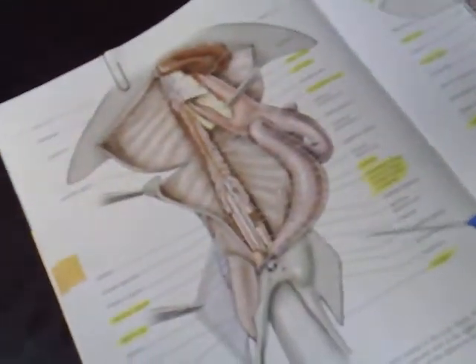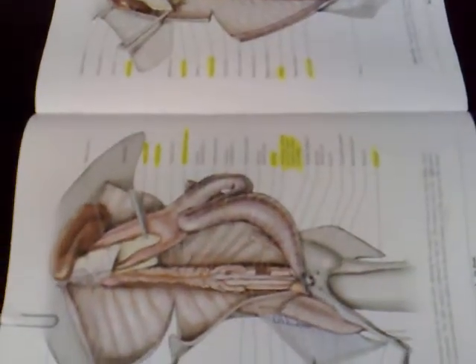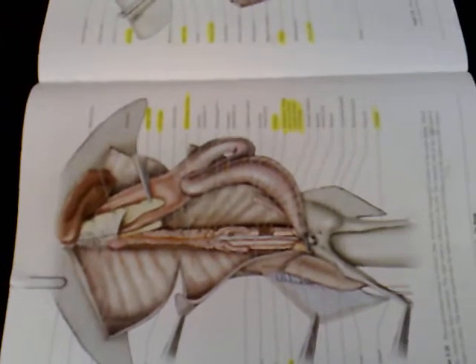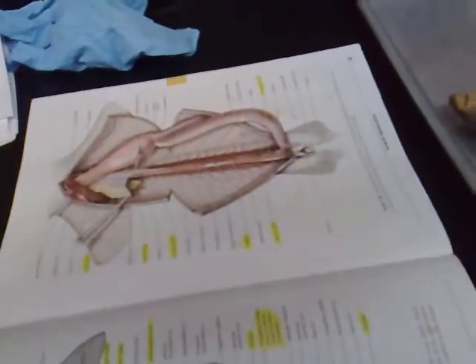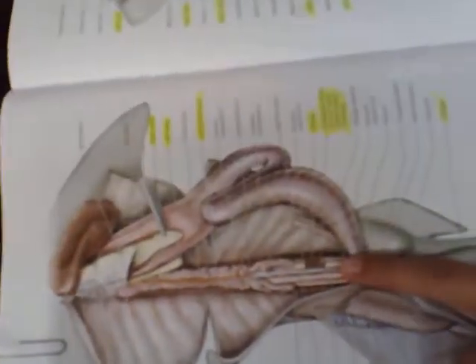The archinephric duct is what carries the sperm, and the accessory archinephric duct — that's what it's called on our sheet — the accessory archinephric duct is responsible for carrying urine. So it's this guy right here.